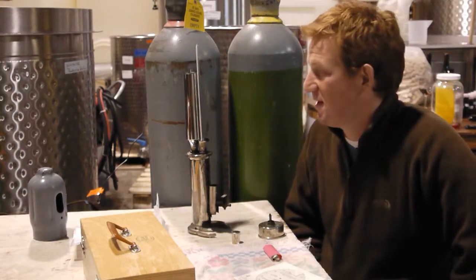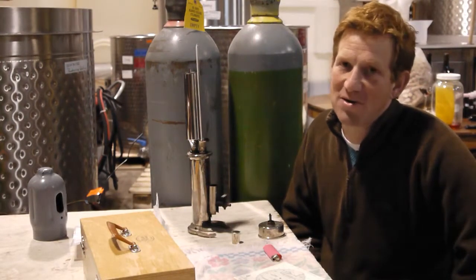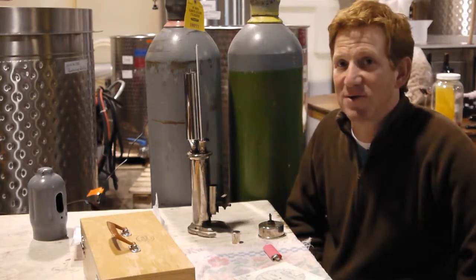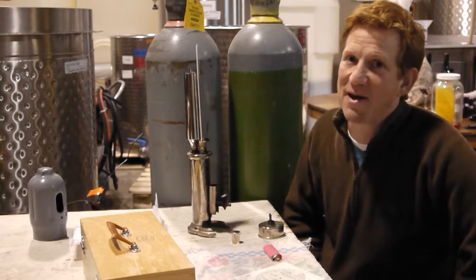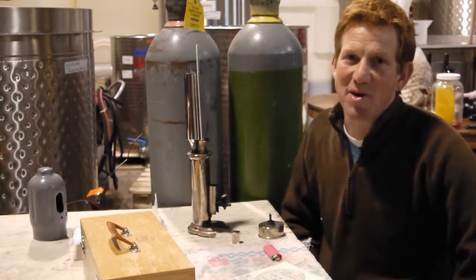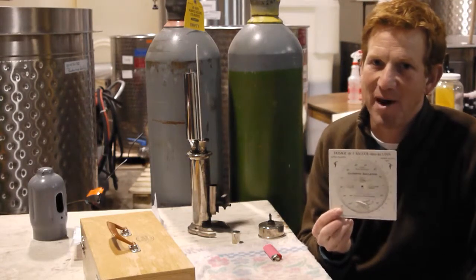Hi everybody. We're doing a little alcohol experiment here to determine how much alcohol is in each of the wines. This is an ancient French apparatus called an ebuliometer. All we do is we boil away water and we find the barometric pressure going on in the atmosphere, and that allows us to look at wines and determine how long it takes for those wines to bubble off. There's a little dosage chart in French so you get to see what it ends up as.